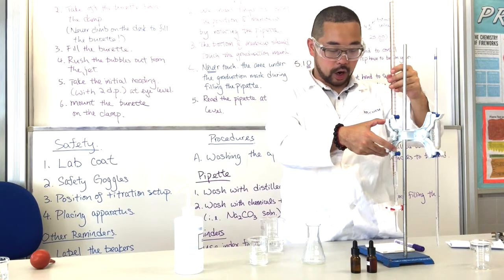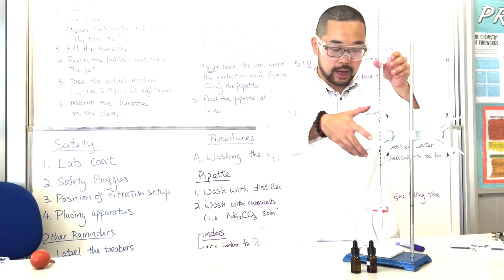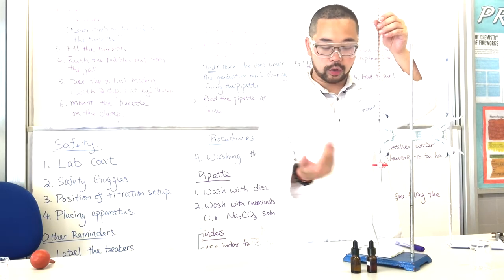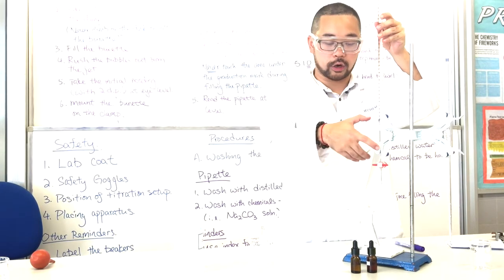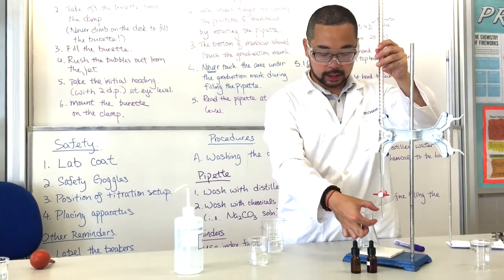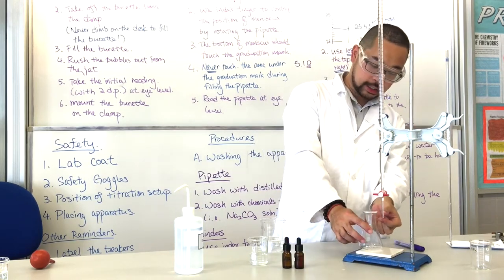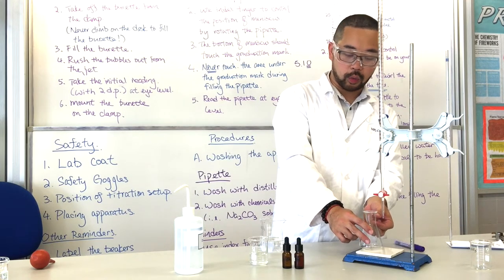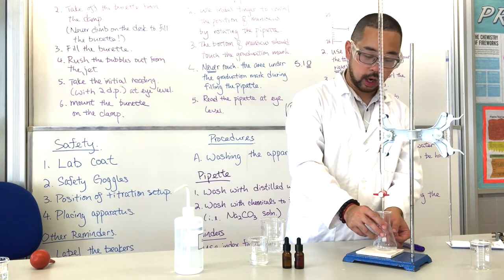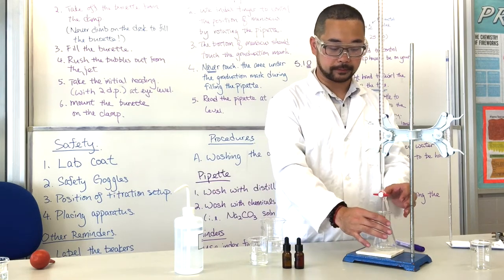Remember the position of the burette. It can't be too low, like this one, and it also can't be too high, because then the liquid will spill out and the titrant cannot get into the conical flask. So what is the best position? The jet of the burette has to be inside the neck of the conical flask. When you put the conical flask under it, it will be a little bit like this, so that all the titrant from the burette gets into the conical flask.